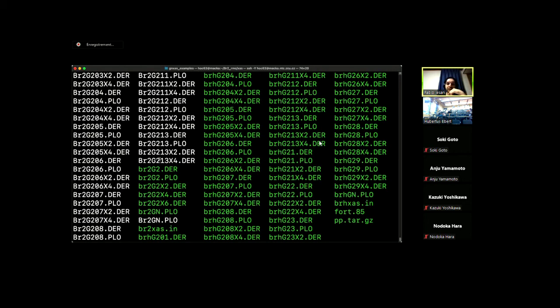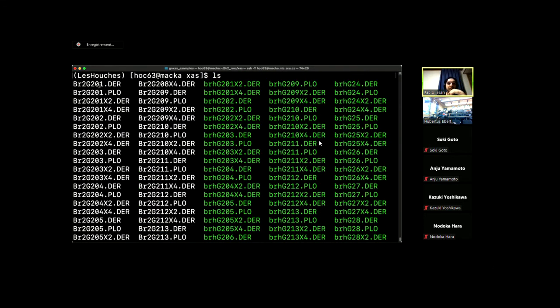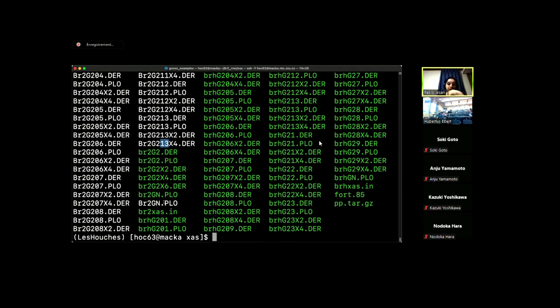So in this case, we will have a total of 13, as I said. The 1 dot there is for total two-body, and 0, 1, x2 and x4 instead are the multiple scattering ones. But in this case, we will use the total ones.